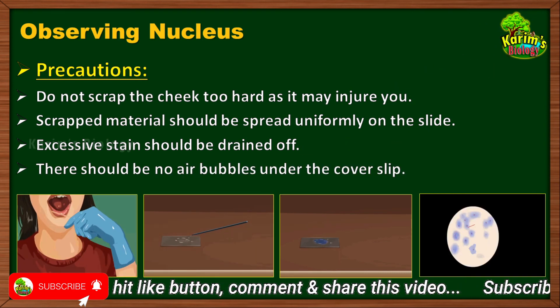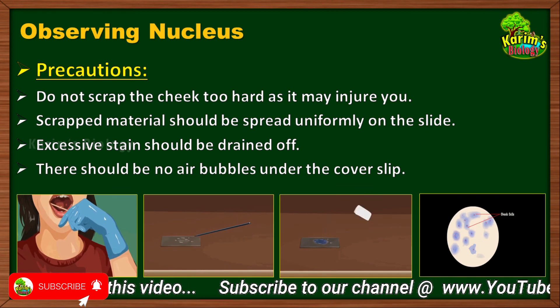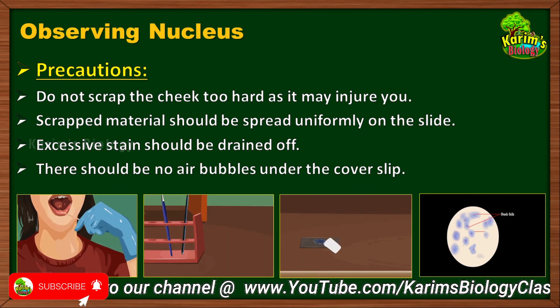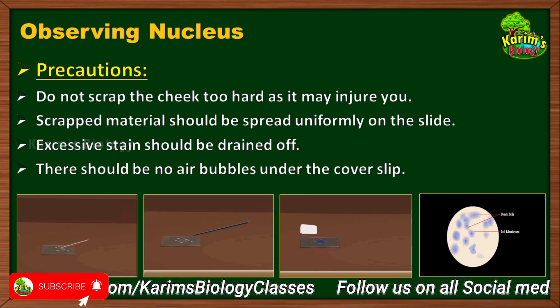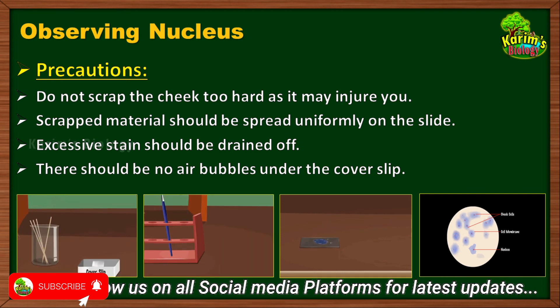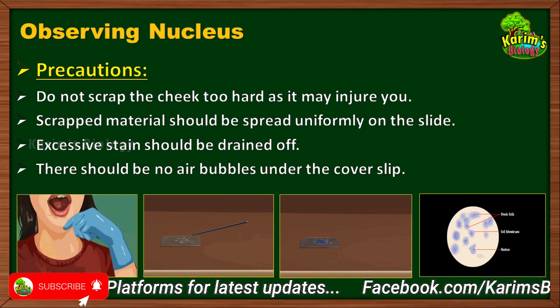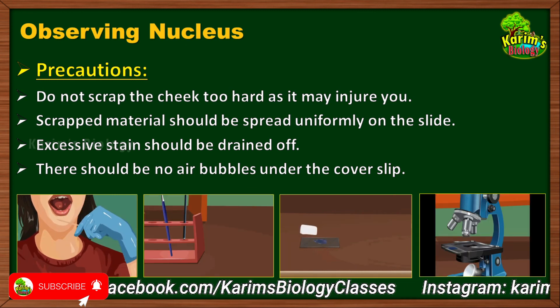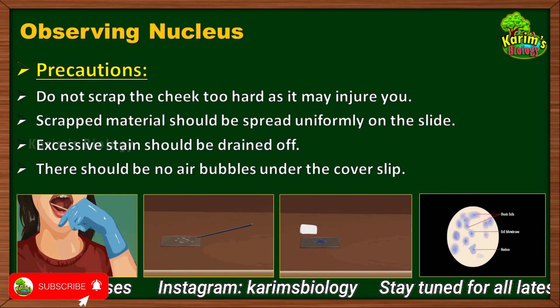The fourth precaution is that there should be no air bubbles under the cover slip. When placing the cover slip, if air bubbles are present, they may appear as cells under the microscope, making it hard to differentiate air bubbles from actual cells. So while placing the cover slip, make sure no air bubbles are formed.